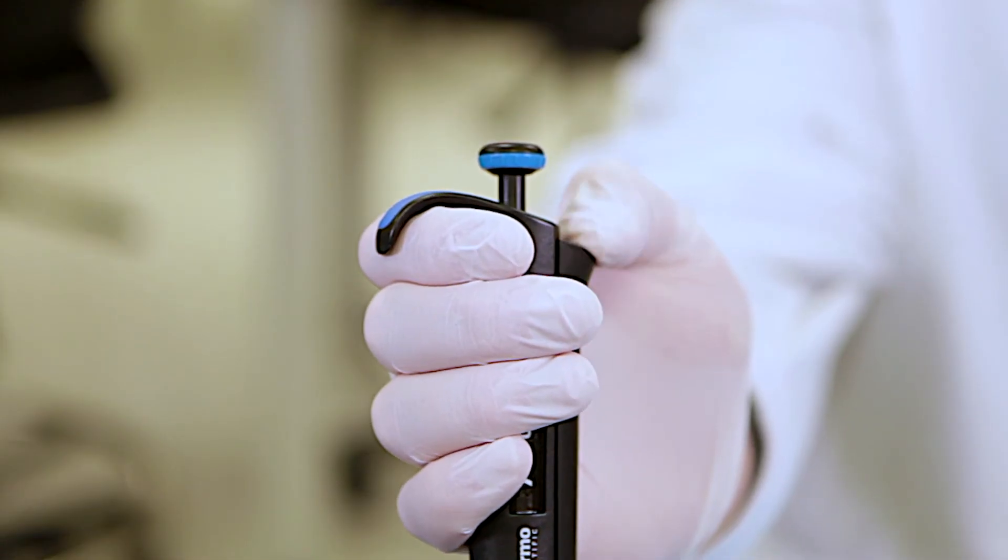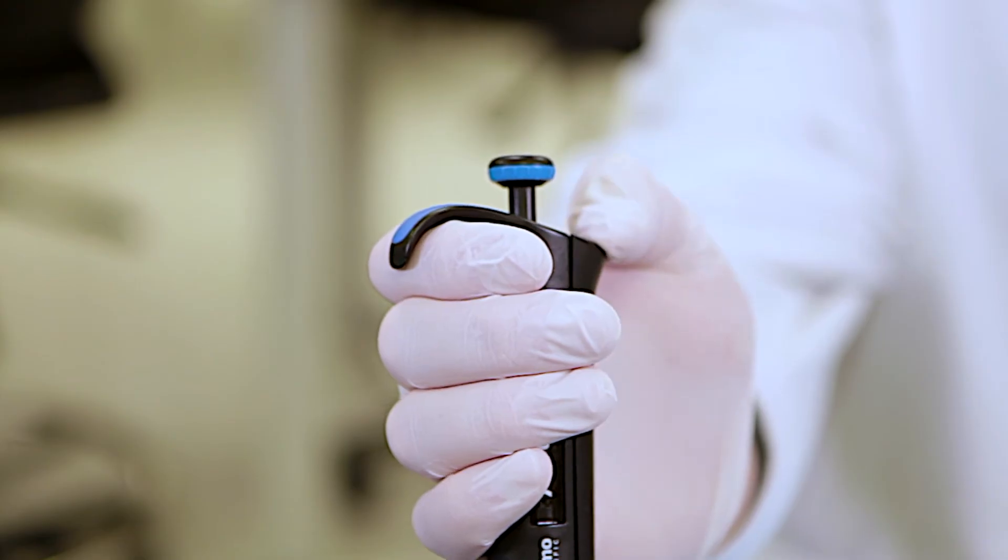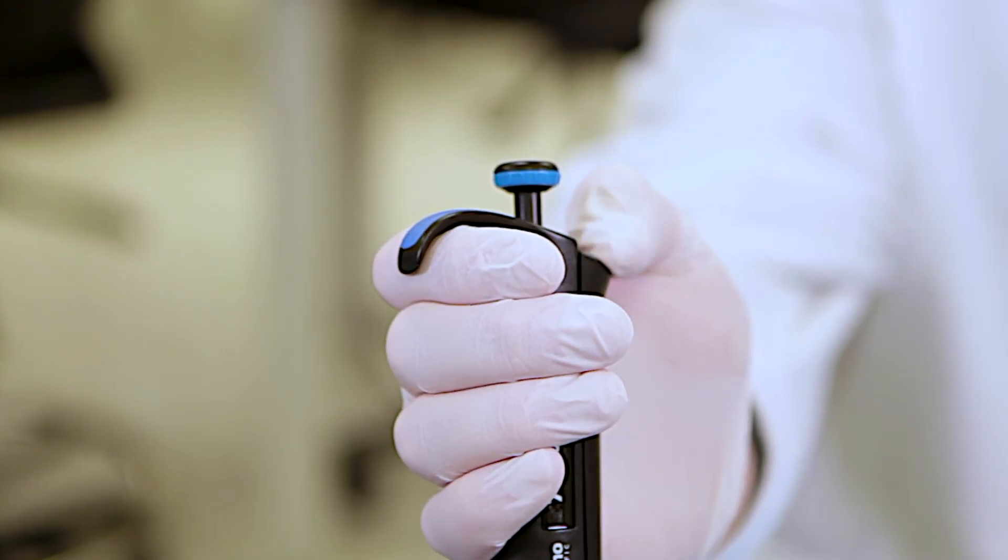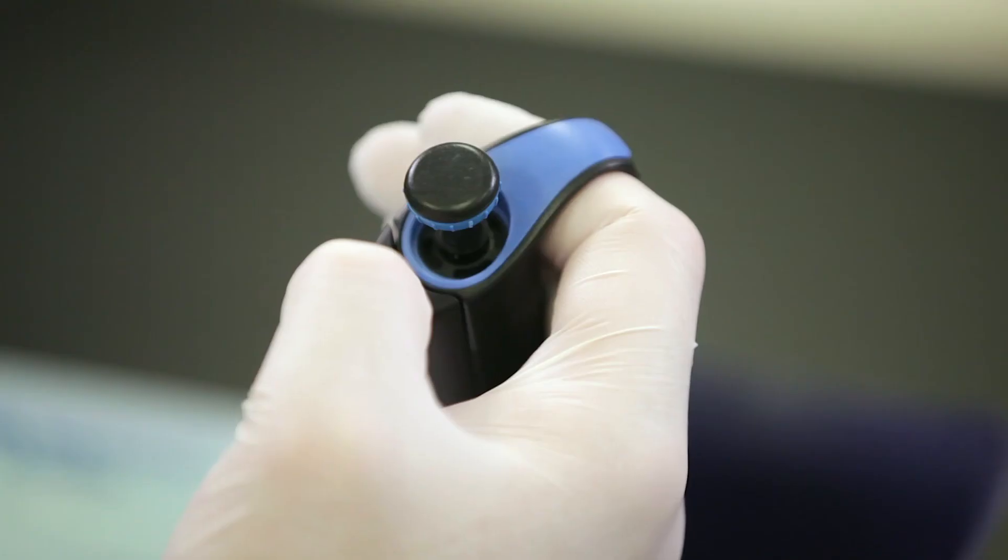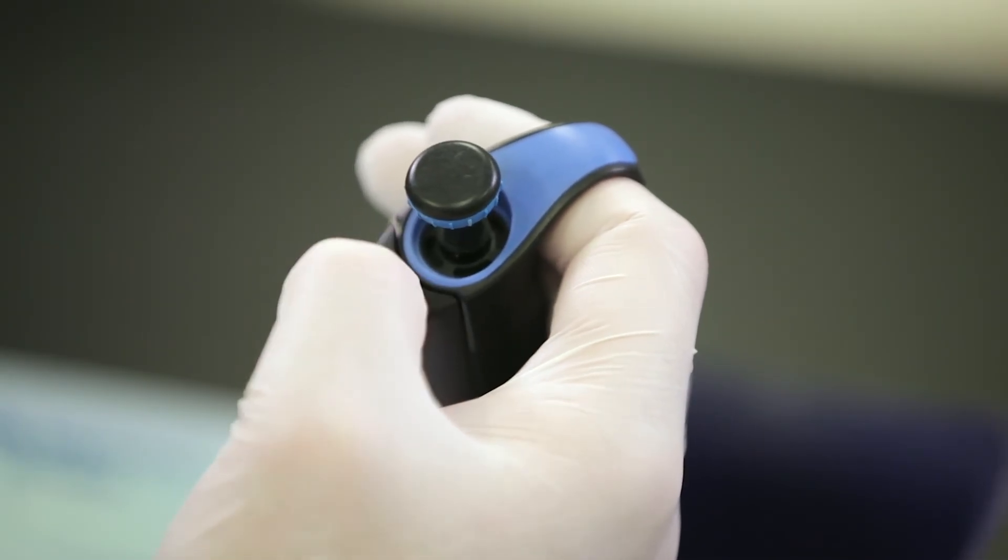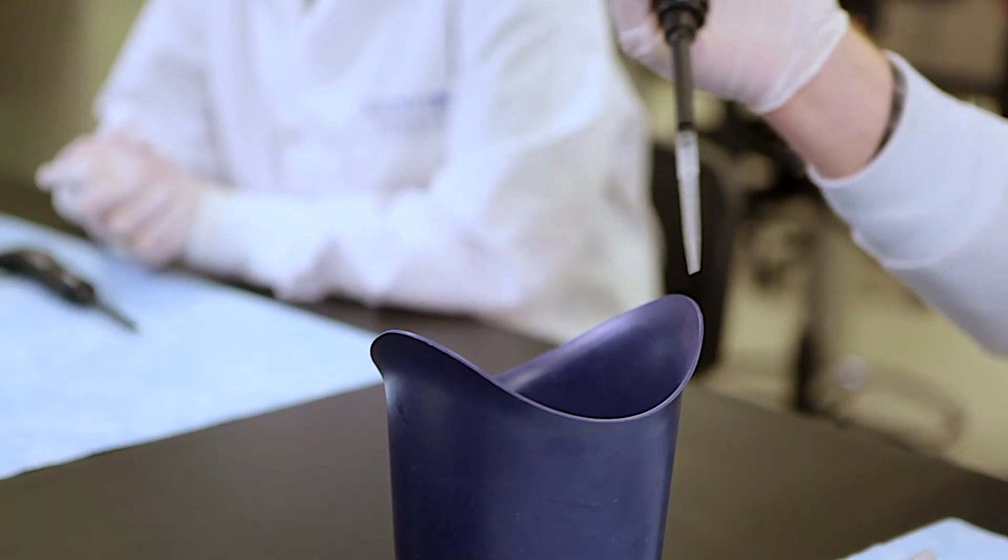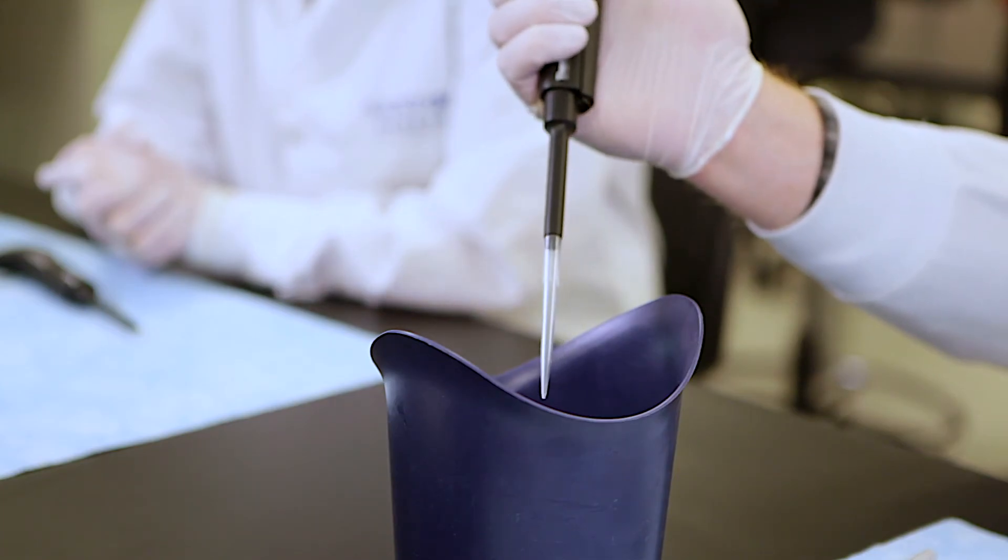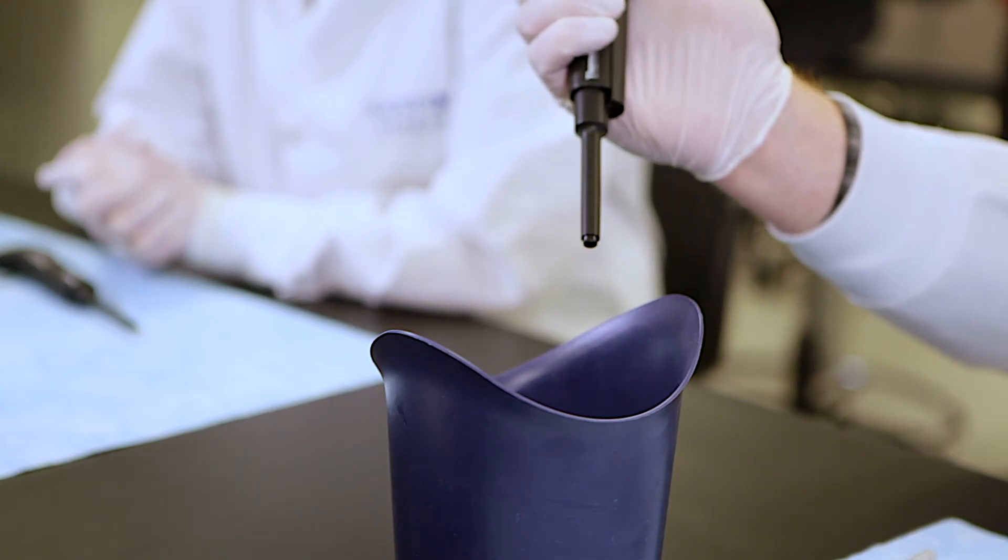Once you have aspirated the liquid, press down on the tip ejector to release the pipette tip from the pipette. The tip ejector is the small button at the bottom of the main body of the pipette. Make sure the attached pipette tip is inside the appropriate waste container before pressing the eject button.